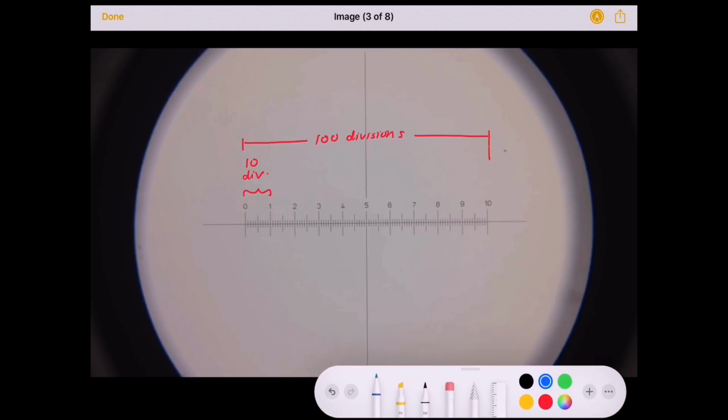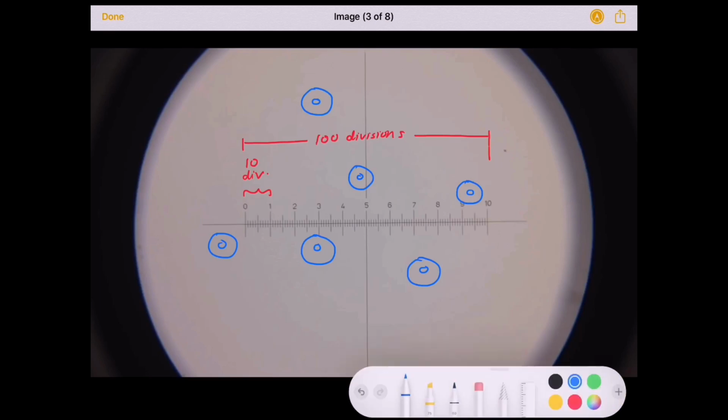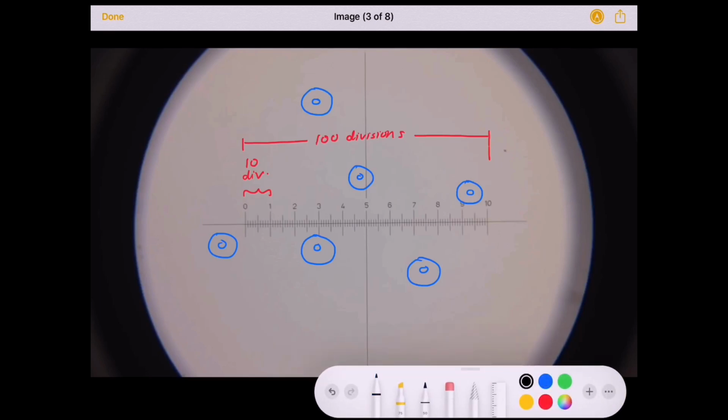For example, you are carrying out an experiment on cheek cells. So you will see many cheek cells within your field of view. You're expected to calculate the actual cell size of your cheek cell. So most likely, you identify one cheek cell that you want to find out the size. You can align the eyepiece graticule in such a way that the number is a whole number, or it's between the lines.